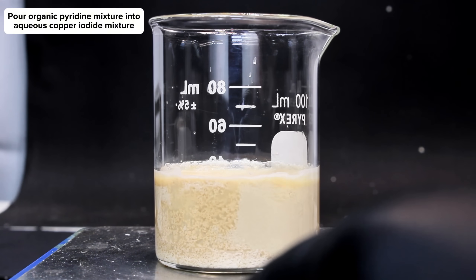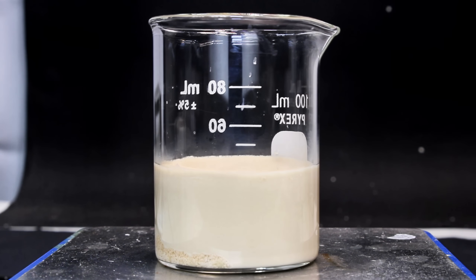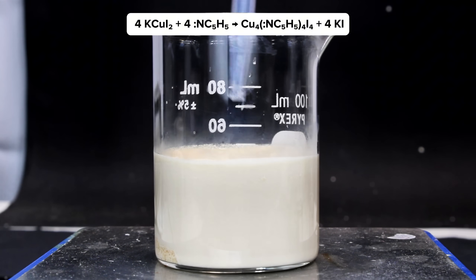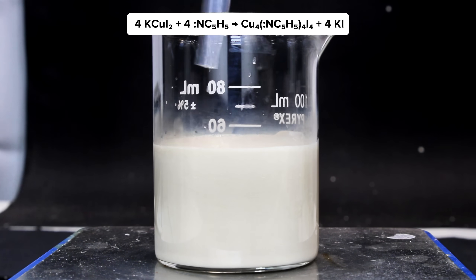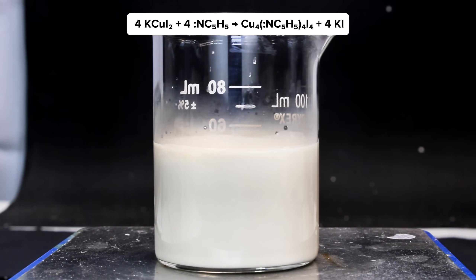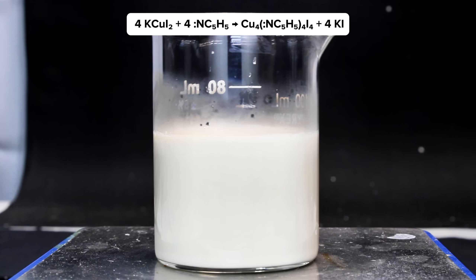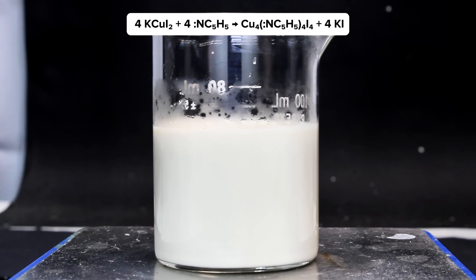Eventually a dense, nearly white precipitate forms, and this is the insoluble complex formed by the reaction shown here. Four molecules of the soluble copper iodide complex react with four molecules of pyridine forming one molecule of the target complex along with four molecules of iodide. This iodide then immediately reacts with the still undissolved copper iodide, which is why you might have noticed it begin to dissolve the moment the reaction began.